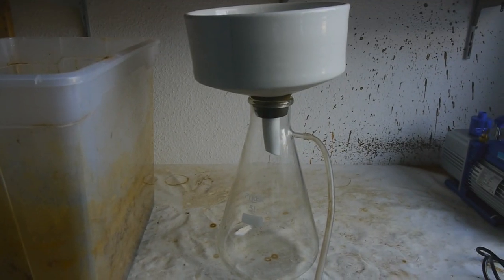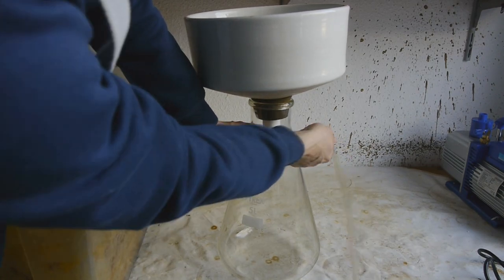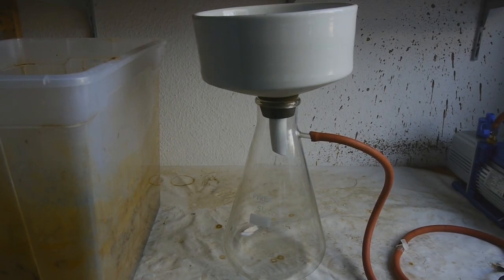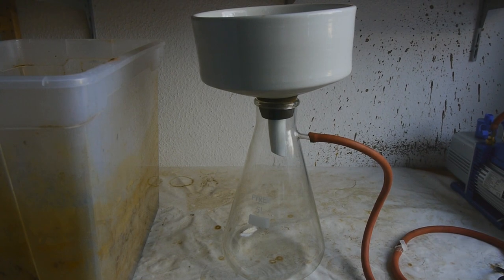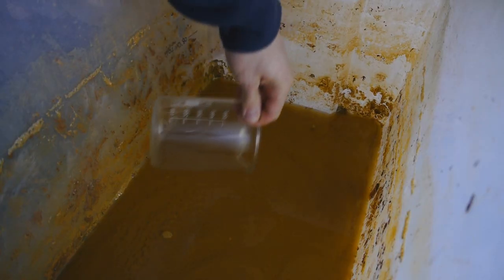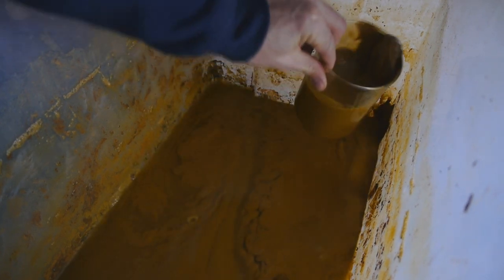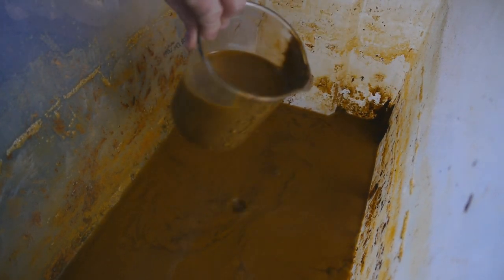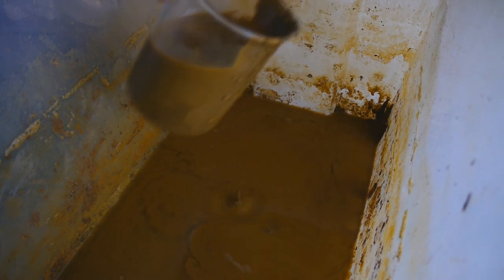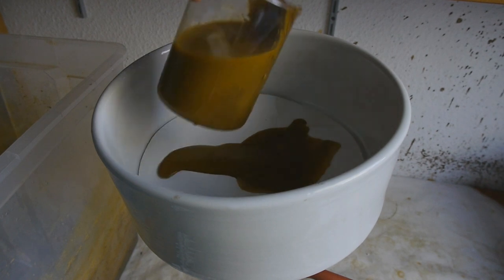It also probably needs some vacuum. And this tube is way too wimpy for that. And now let's just try to transfer something into this funnel. So we'll use this half-liter beaker to scoop some of this stuff up. That looks amazing. And then I will try to pour it onto this frit.